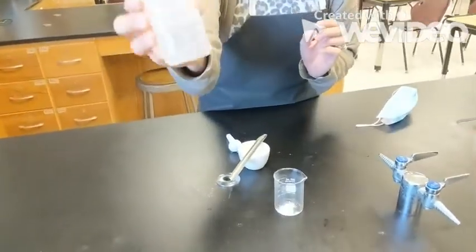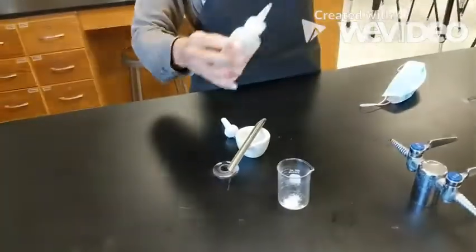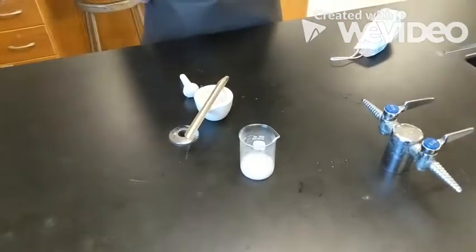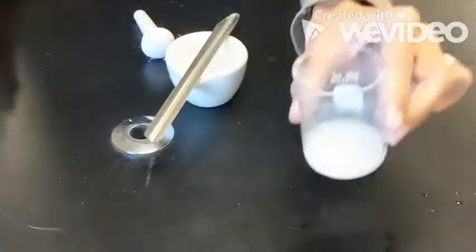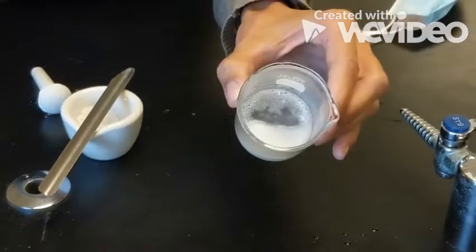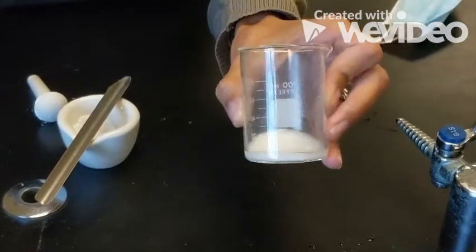And I'm going to take a couple drops of that vinegar, and we're going to place it into our substance, and we're going to watch what happens. Make sure you take note of anything that you're seeing in your data table, and then you're going to predict if it is chemical, physical, or both.